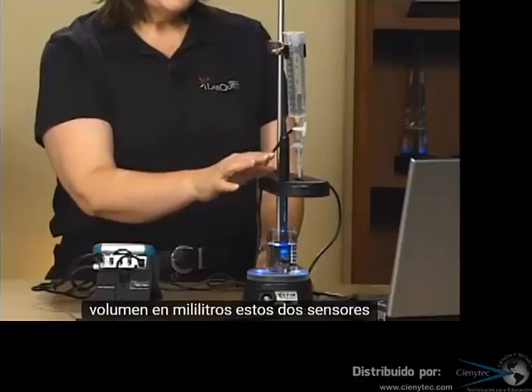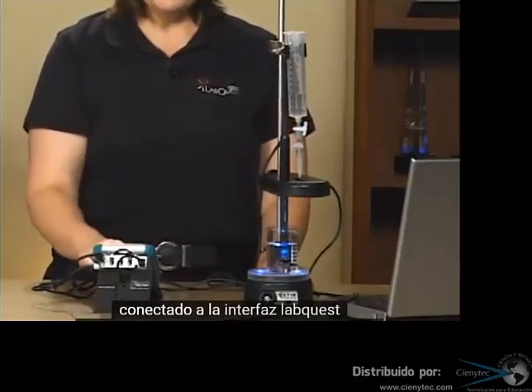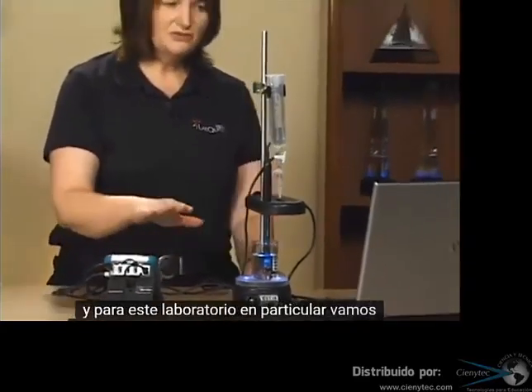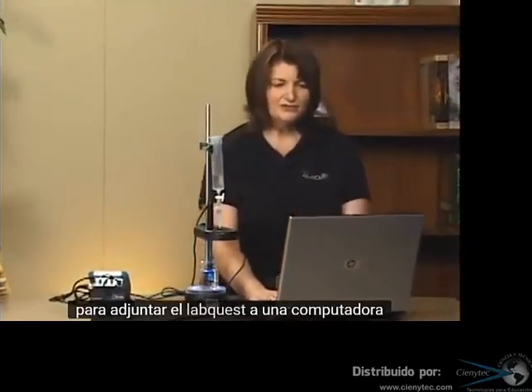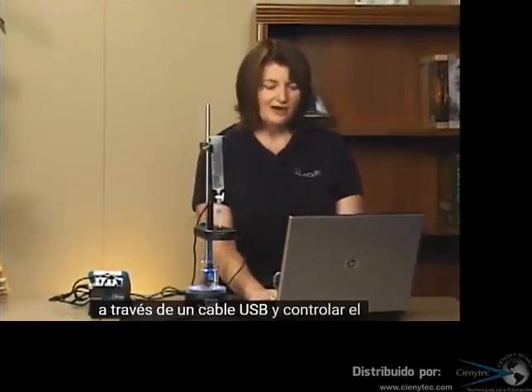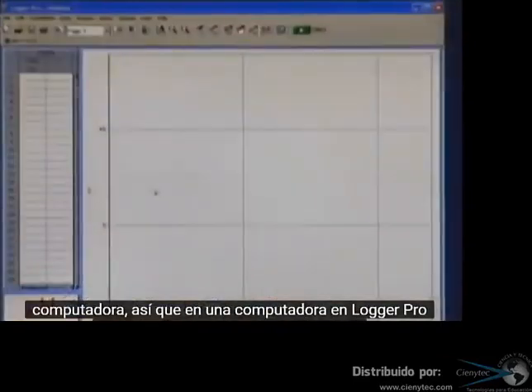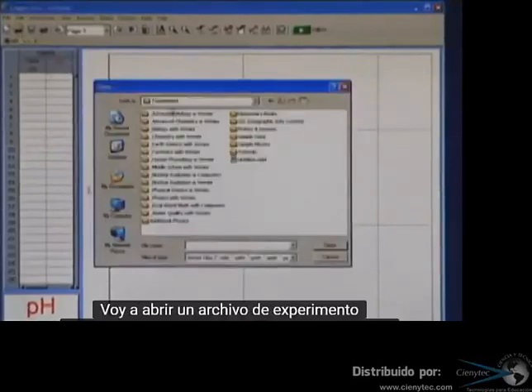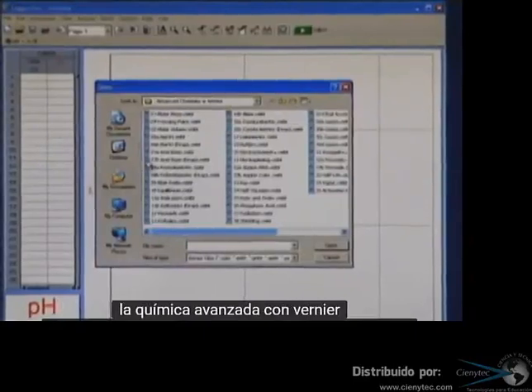These 2 sensors, the drop counter and the pH sensor, are connected into the LabQuest interface. And for this particular lab, we're going to attach the LabQuest to a computer through a USB cable and control the titration with Logger Pro on the computer. So on the computer in Logger Pro, I'm going to open an experiment file from the Advanced Chemistry lab book. In the Advanced Chemistry with Vernier folder, I'll open up lab number 7.